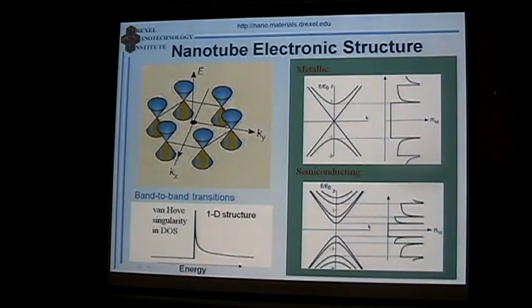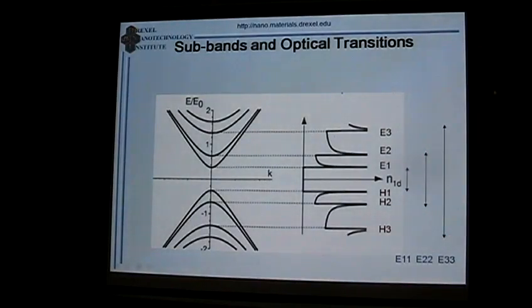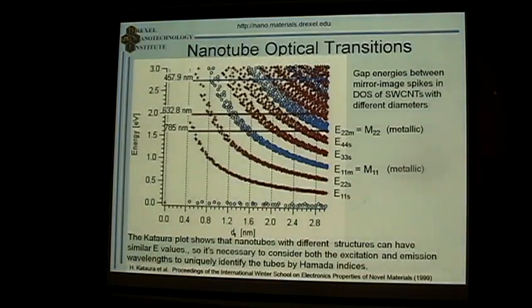Well, we talked about nanotube electronic structure, and I don't remember if I mentioned yesterday these Van Hove singularities for the transitions here, but what is important here? If you look at the density of states of nanotubes, this is an example of a semiconducting tube, you can basically monitor optical transitions that occur in the nanotube and benefit from doing this here.